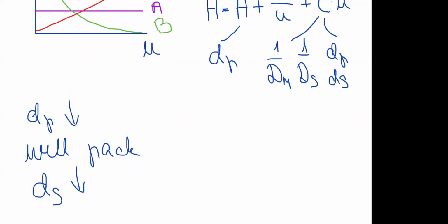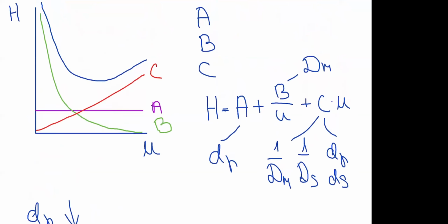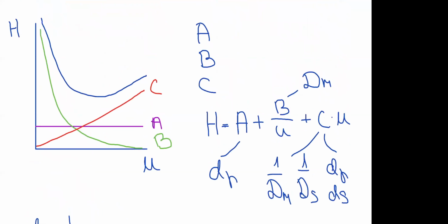However, we will see later that the columns don't definitely need to be packed, but still the same factors will then also influence the performance of the chromatography. And this is something we will see in case of gas chromatography for the capillary columns.